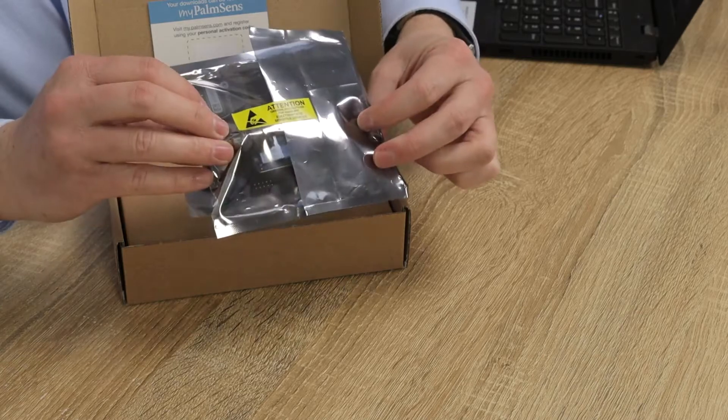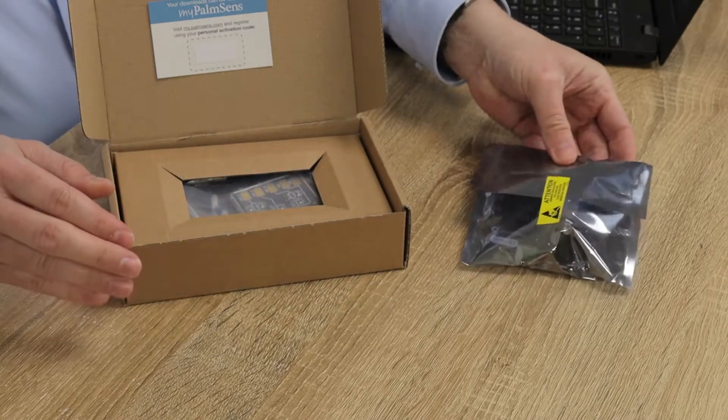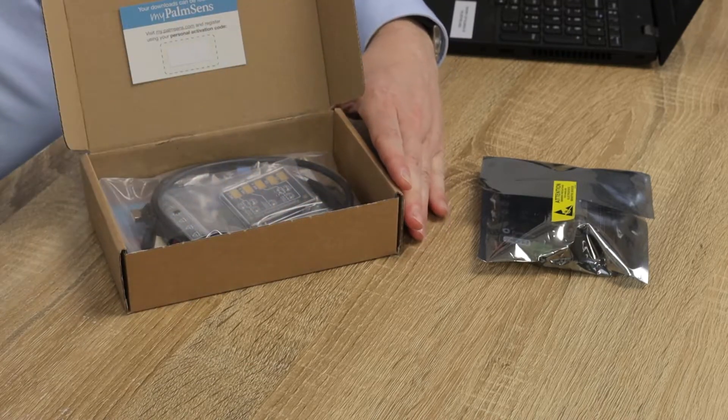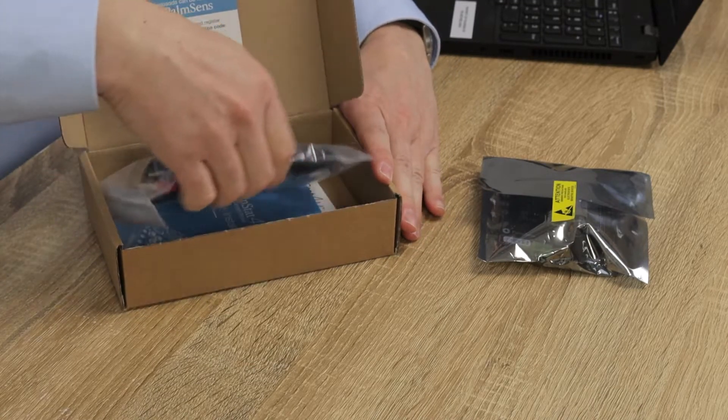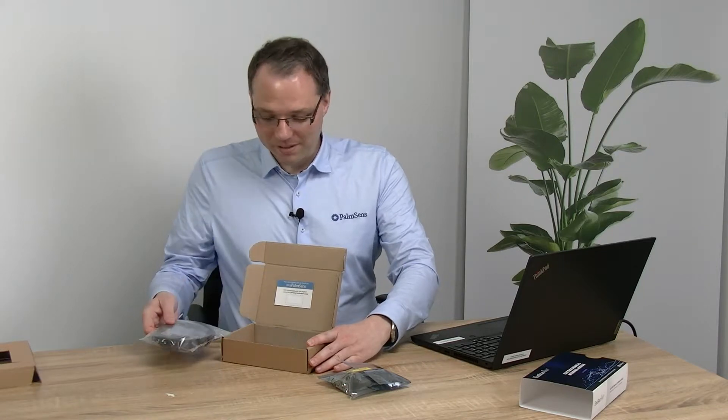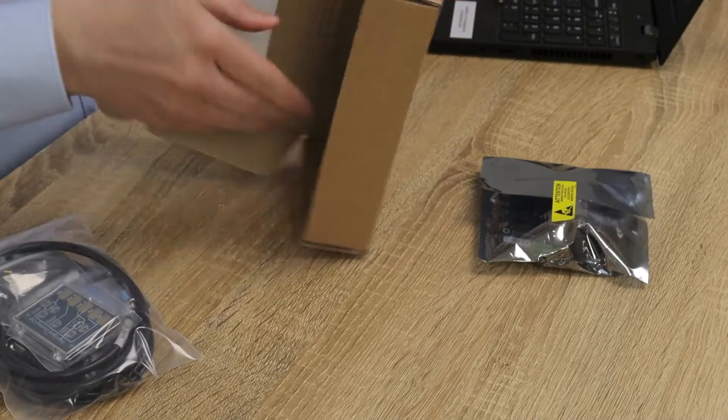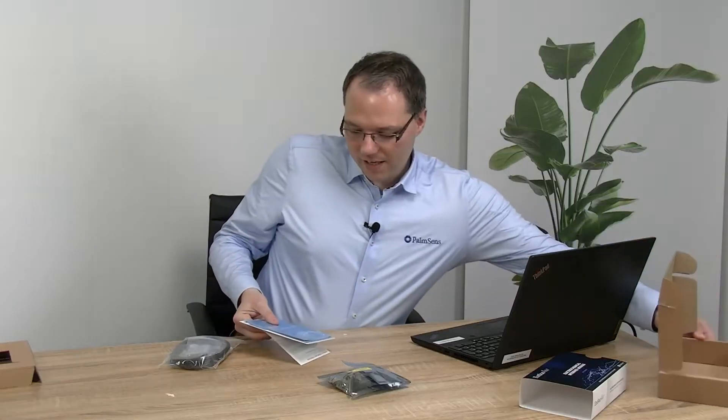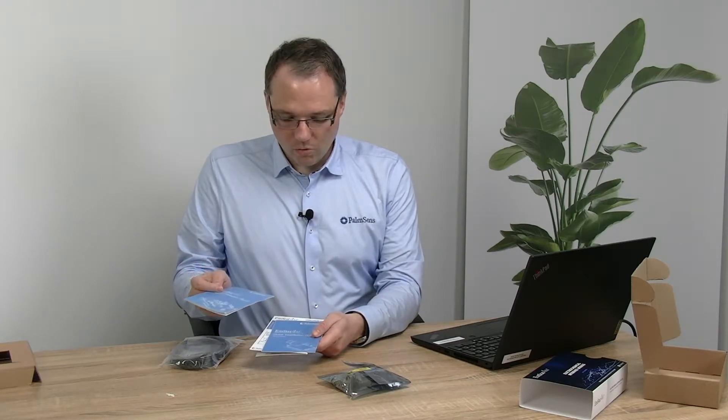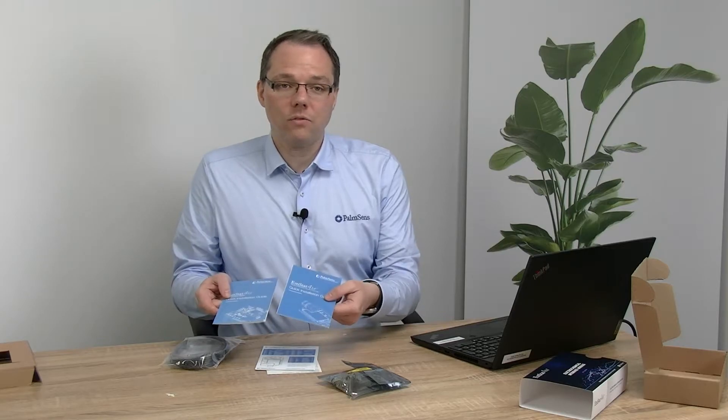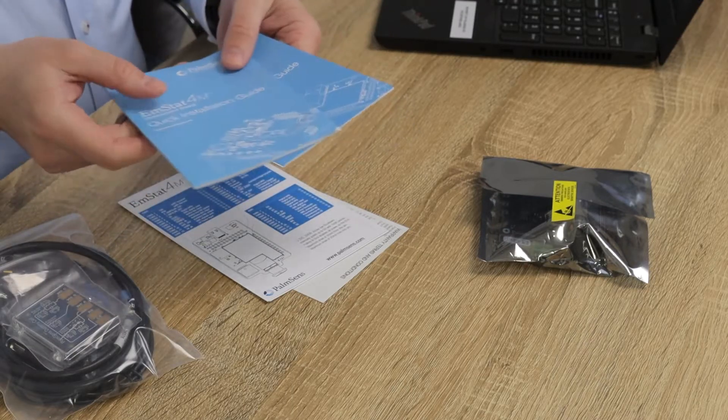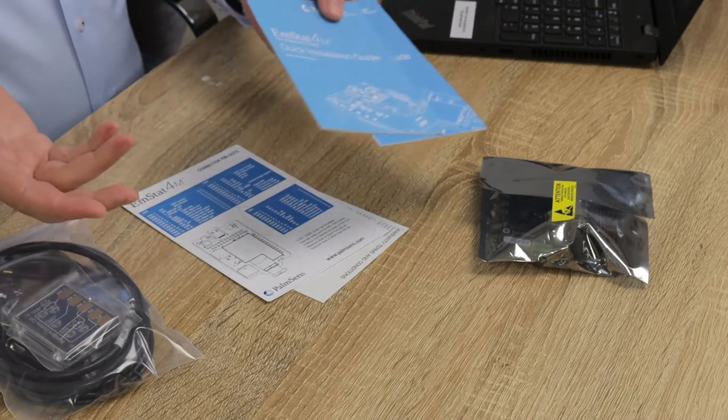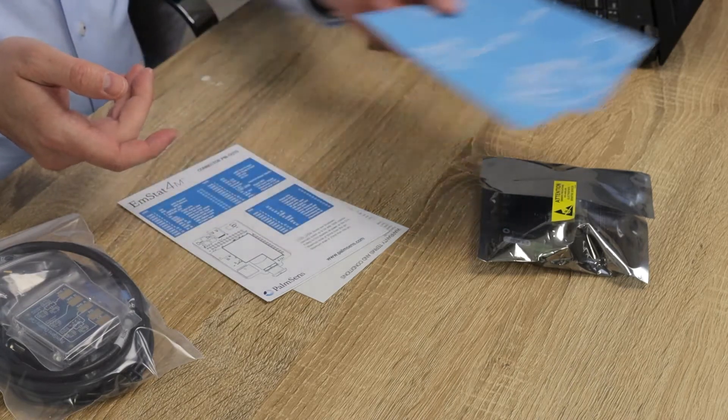We have the development board itself, of course, and I will take a closer look at that in a minute. First I would like to look at what else is in here. We get a bag of cables that I will have a look at after, and that is some documentation. For example, we have a quick start—actually two quick starts, one for the board and one for the potentiostat module itself. This is good if you don't want to watch these kinds of videos and you rather prefer to read this yourself.